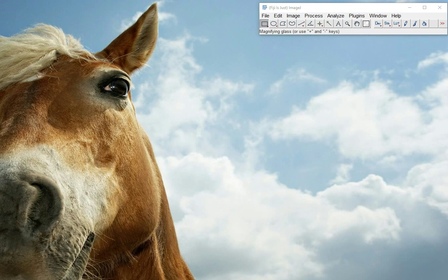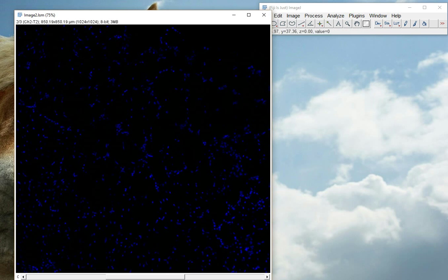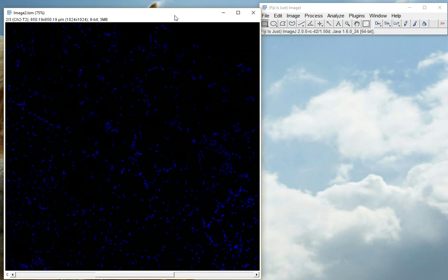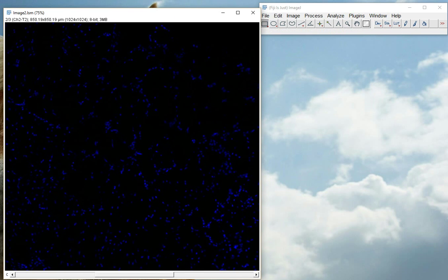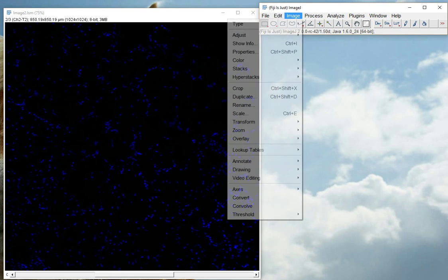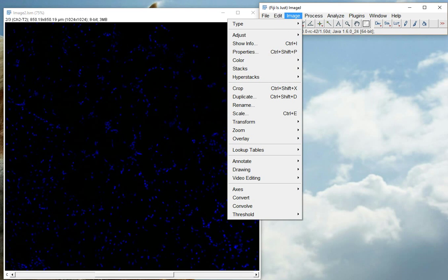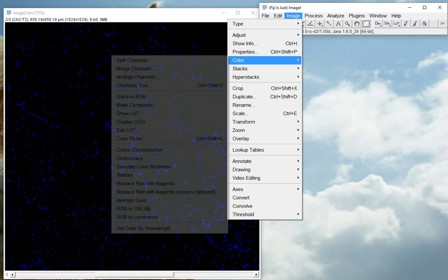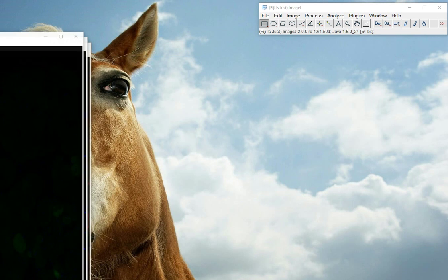So we'll start with an example image. For argument's sake, let's do an analyze particles analysis on the blue channel, which is nuclei in this case. So we'll quickly split the channels.